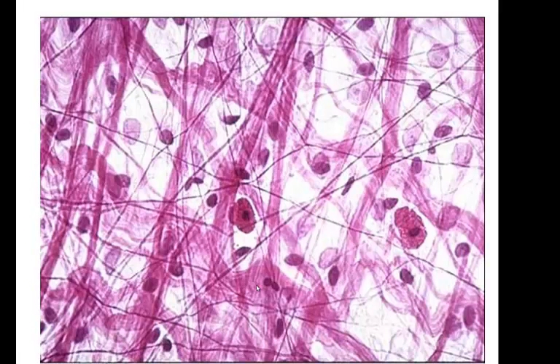This is another picture of areolar connective tissue. The fibers here are just more pronounced, and you see a lot of cell types here. This might be a fibroblast, this might be a macrophage here and here. So you can't really identify the different cell types, or I'm not good at it anyway. And these are the collagen fibers. The biggest ones are the collagen fibers, the smallest ones are the elastic fibers, and the medium-sized ones are the reticular fibers. But what you want to notice with the areolar connective tissue is it just looks a mess.